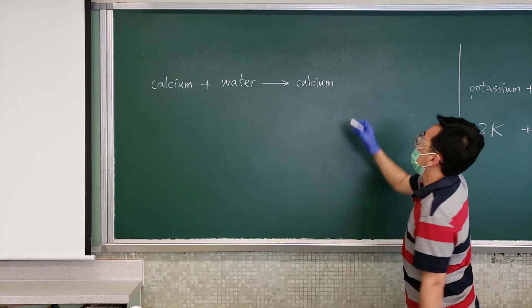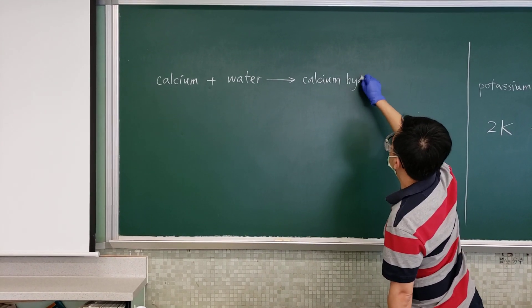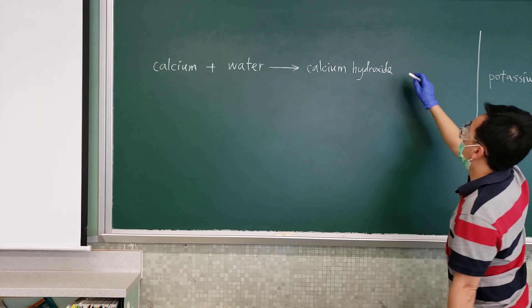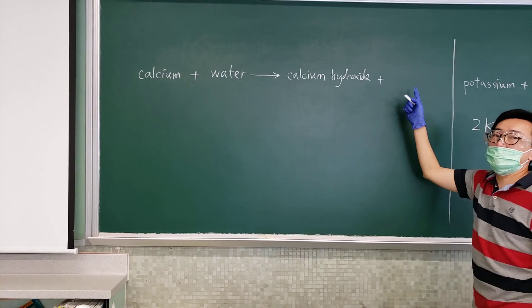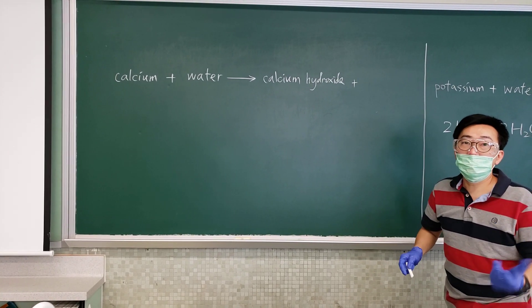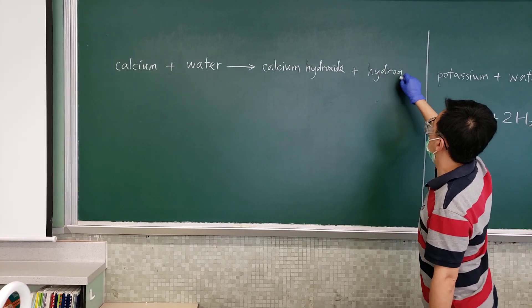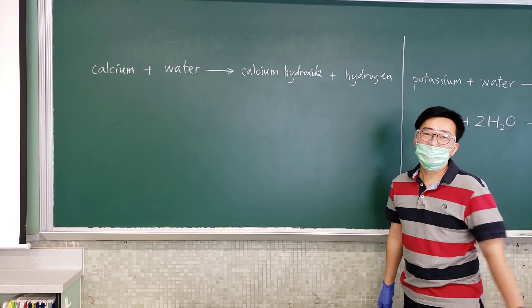Producing a calcium compound. Calcium hydroxide. And the gas. What is the gas? It burns with the pop sound. Therefore, it is hydrogen.